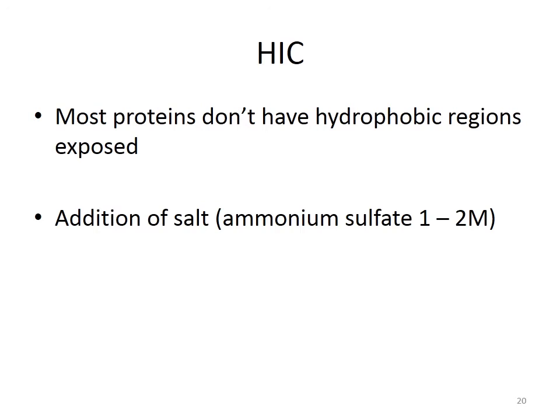So we can open up the structure of the protein and expose the hydrophobic regions by addition of salt. Generally, the salt of interest for this purpose is ammonium sulfate, and the concentration of salt is generally kept high, around 1 to 2 molar.